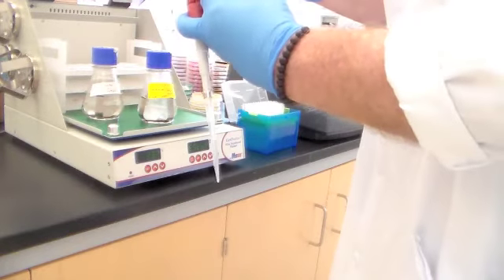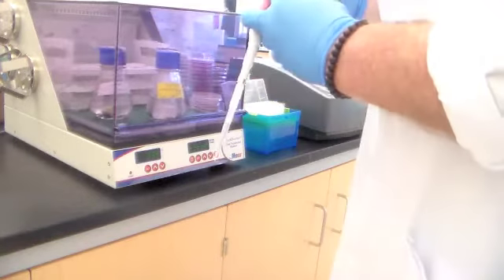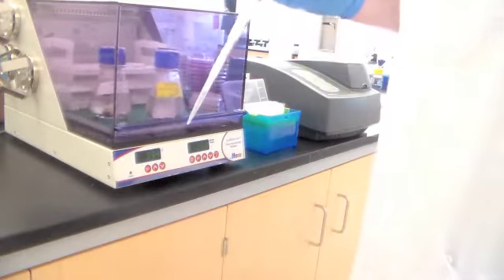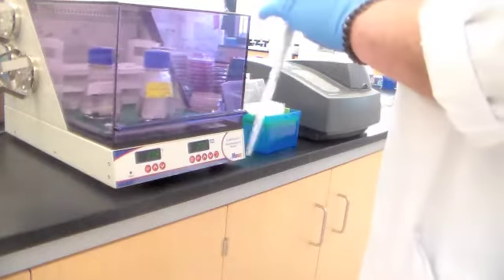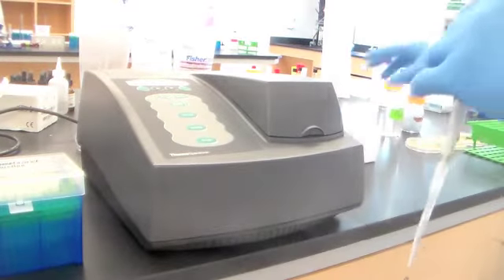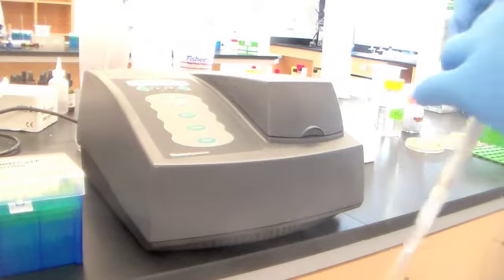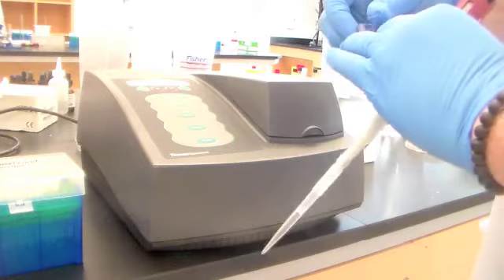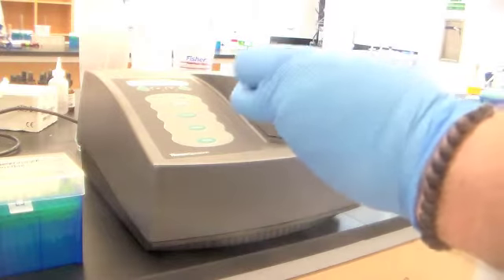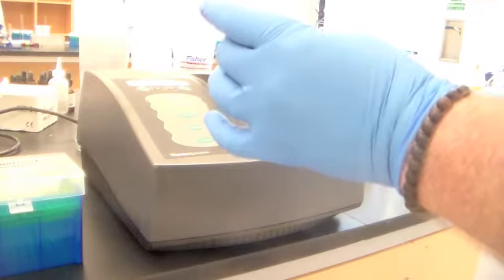These are in magnetic clamps, so you can just set it back into there, close the cover, and it will begin to grow. Okay, now with that 500 microliters, the first thing that we're going to do is take an optical density reading. We're going to use a spectrophotometer to determine how much light is absorbed by this particular culture. There are cuvettes here that you will pipette your 500 microliter sample into.